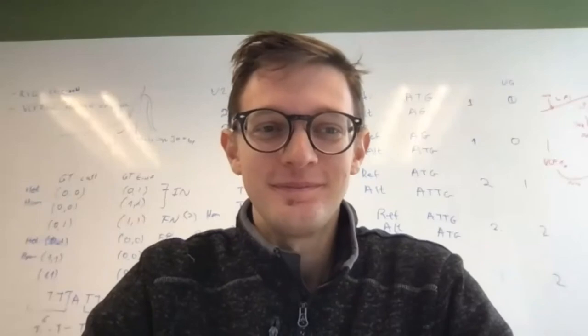Okay. All right, we've got a question here from Anonymous asking, does DRAGEN-GATK work for low coverage data? Looking at 1x to 5x coverage. What are our thoughts on that?